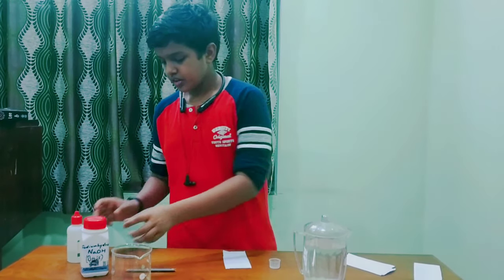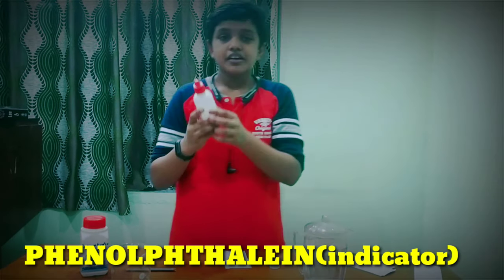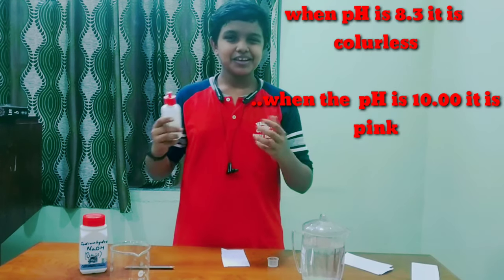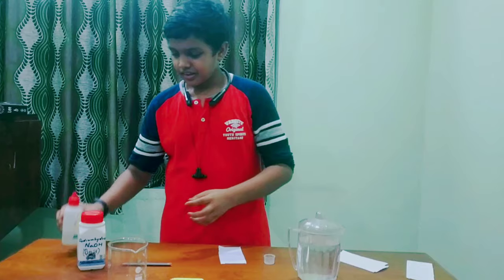The first chemical is phenolphthalein — you can say phenolphthalein. Phenolphthalein is an indicator. When the pH is 8.3 it is colorless, but when the pH is 10.0 it turns pink or red color.